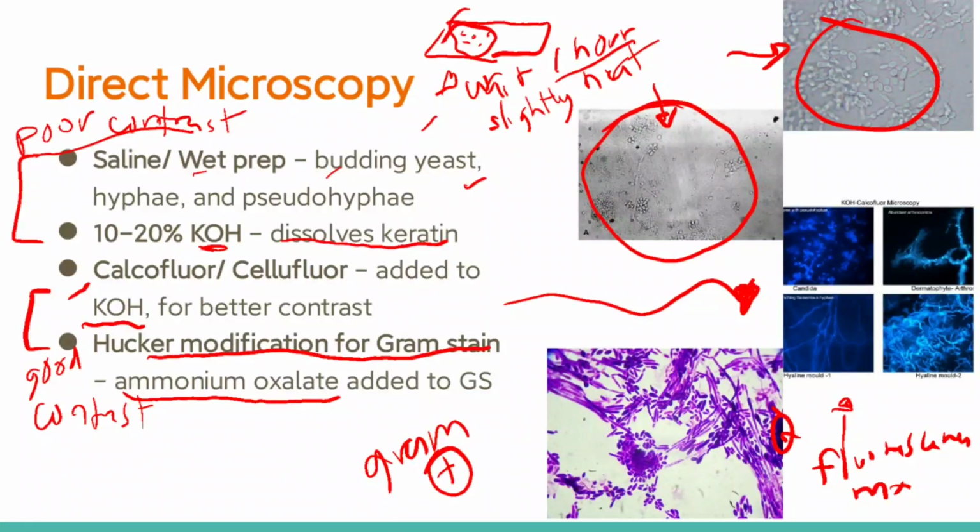Okay? Para at least, if you stain fungal elements, no, yung mga hypha, budding yeast, mga pseudohypha, mga spores, conidia, ganun, medyo light purple na sila. No? Hindi na ganun ka-dark. So, at least you can see certain structures, no? Kung meron ba silang septations, ganun. Okay? So, mas ma-appreciate sila dyan.